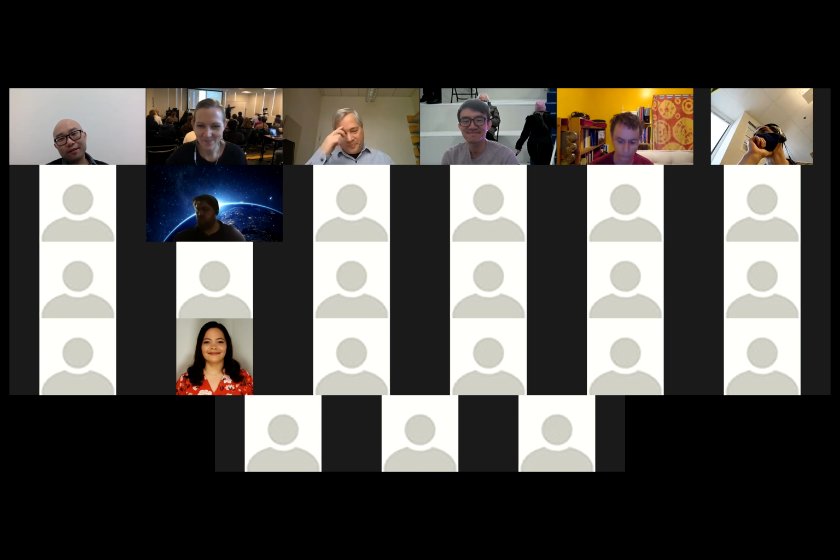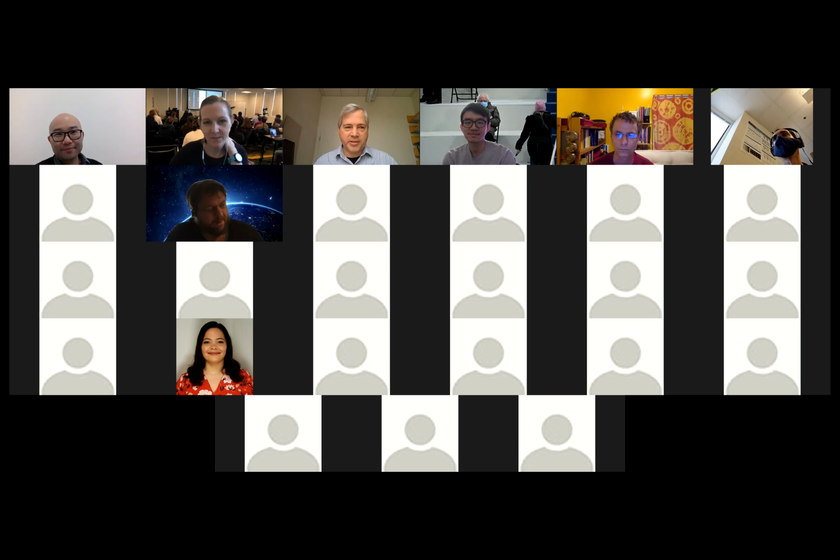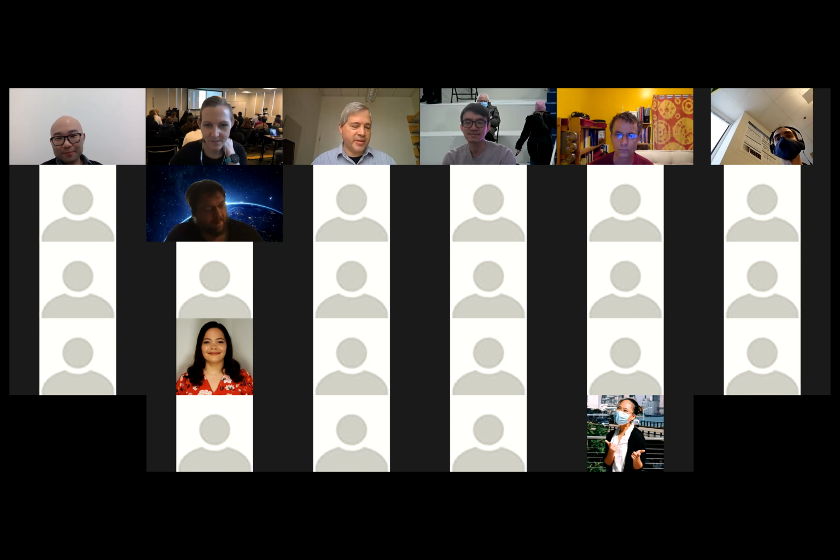How do you feel the cryo-EM field has progressed over the years from, I guess, your early EM days to now, the more autoloader systems? Yeah, well, now it's a lot easier and more robust, it's easier to get going, and it has brought a lot more people into the field. And of course, since the resolution revolution, when the new detectors came out, it's really expanded the field. So it's been quite exciting to see a real revolution happen in what you've been working on. So that was quite amazing.